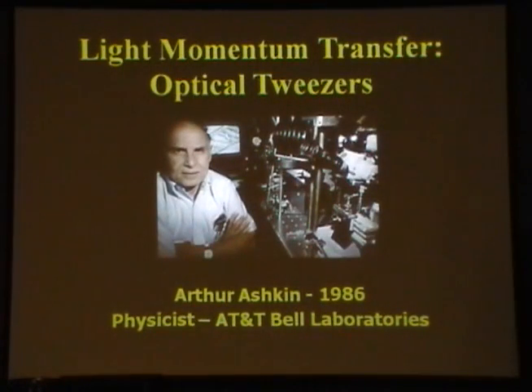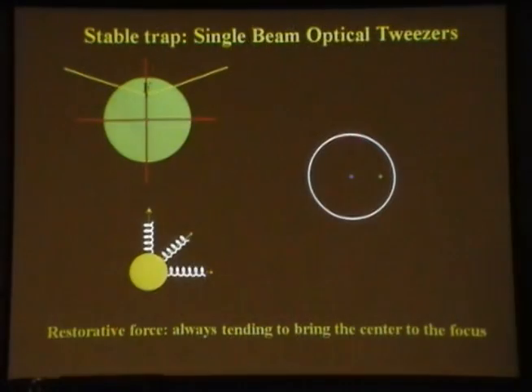So let's start with the first techniques. They were the first one that brought me to this field. I learned with Arthur Ashkin back in the Bell Labs in 1986. I came there in 1988, so I saw him doing all sorts of tricks with optical tweezing, and I said, oh, that's so beautiful, I want to play with that. So when I came back to Brazil in 1991, I started my own homemade optical tweezer there.